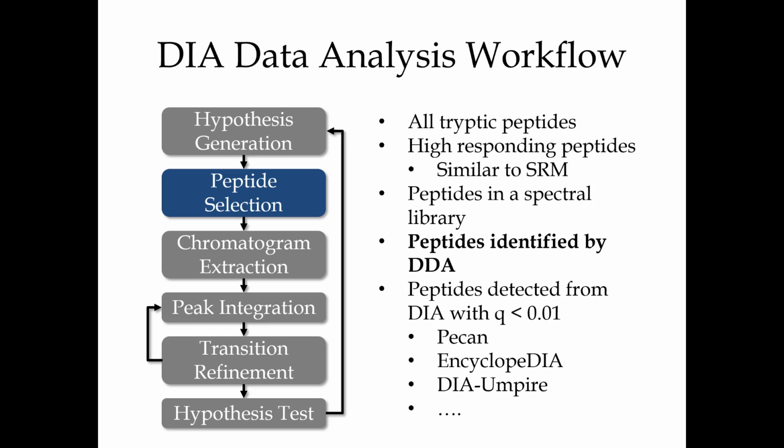Maybe they created a library at ETH called the Pan-Human Library. So it's like tons of fractionation collected on their own machines. What they felt they could see, probably really close to that 14,000 proteins that Rudy talked about. And you could go use that to query DIA data. And we're gonna get into talking about how effective that is. Yeah, the Pan-Human Library. So yeah, we're gonna talk about that.